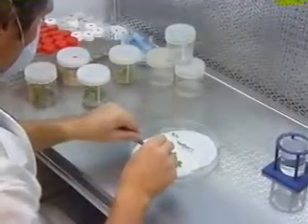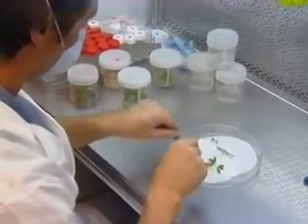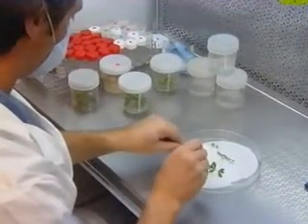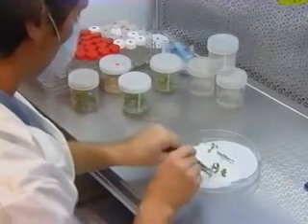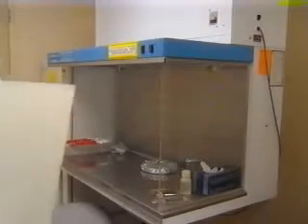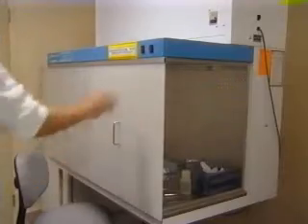Since there is a continuous airflow through the inoculation cabinet, it is practically impossible for anything to pass from the outside room into the cabinet itself. When the cabinet is not in use, it can be closed from the outside air by use of plastic shields like this. The laminar flow cabinets are also fitted with a UV light, which can be used prior to the time one needs to use the cabinet.